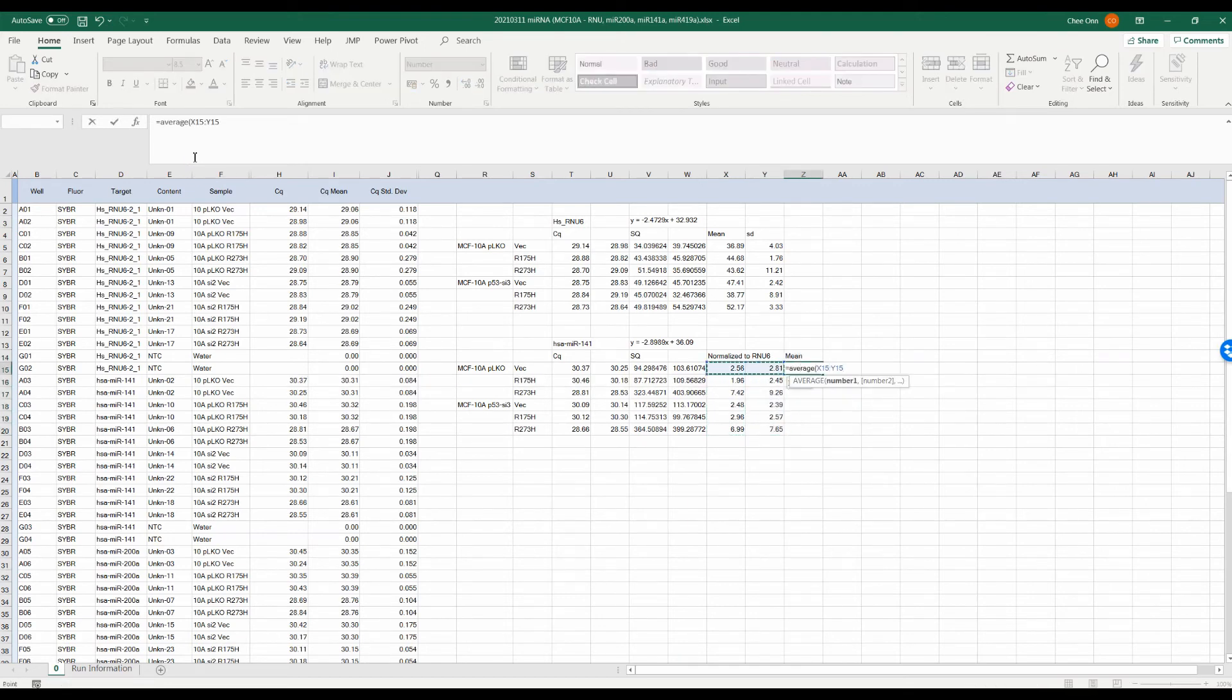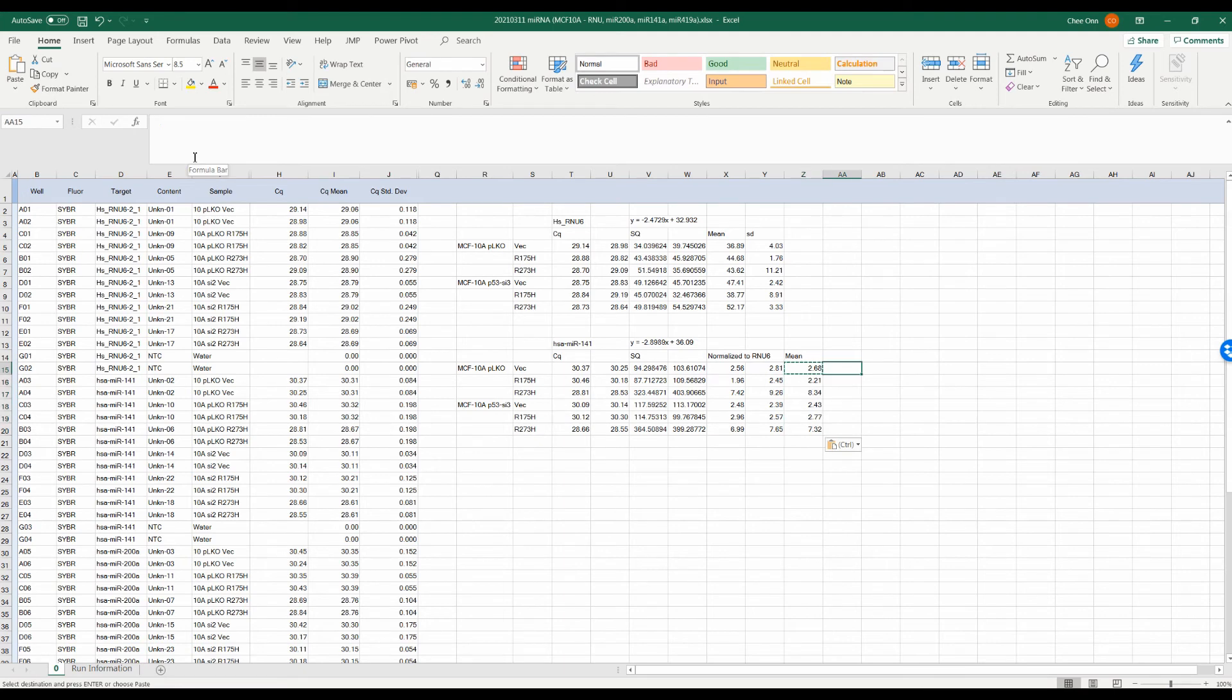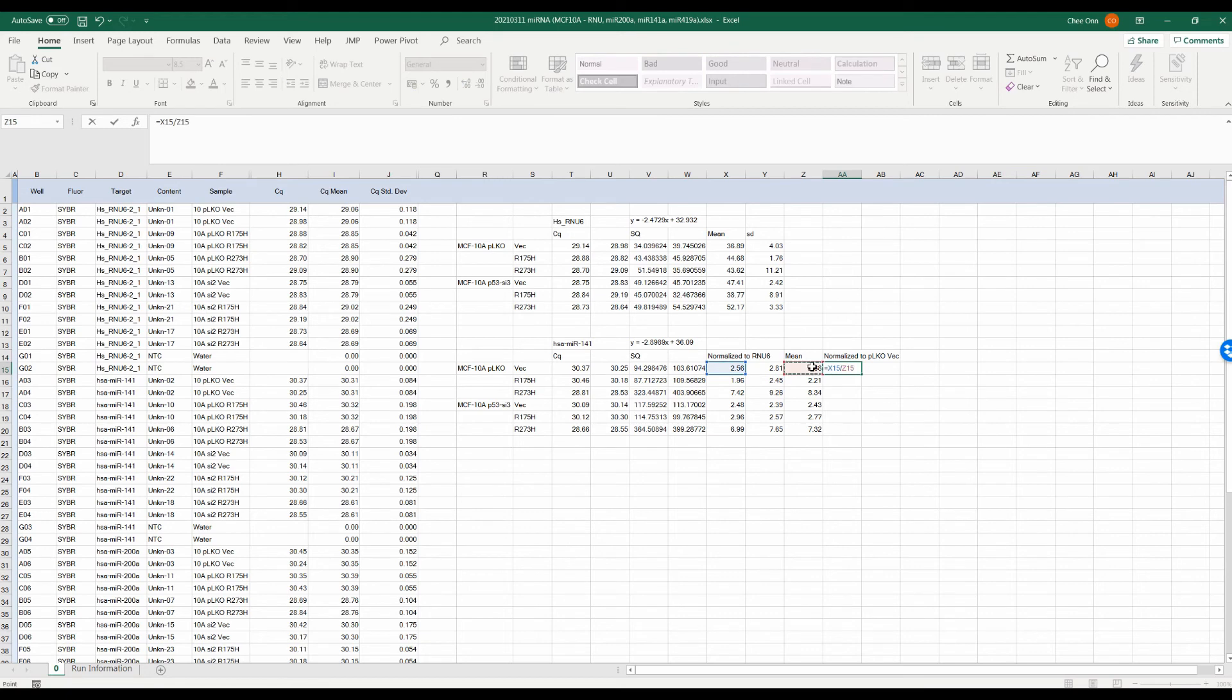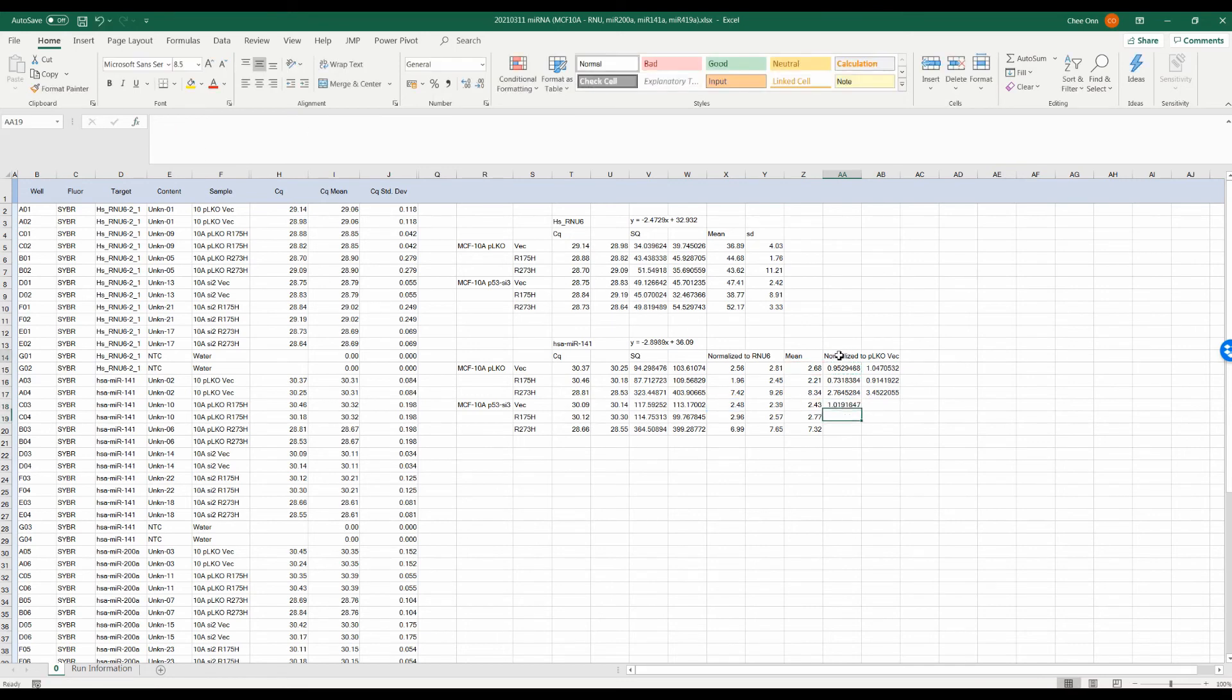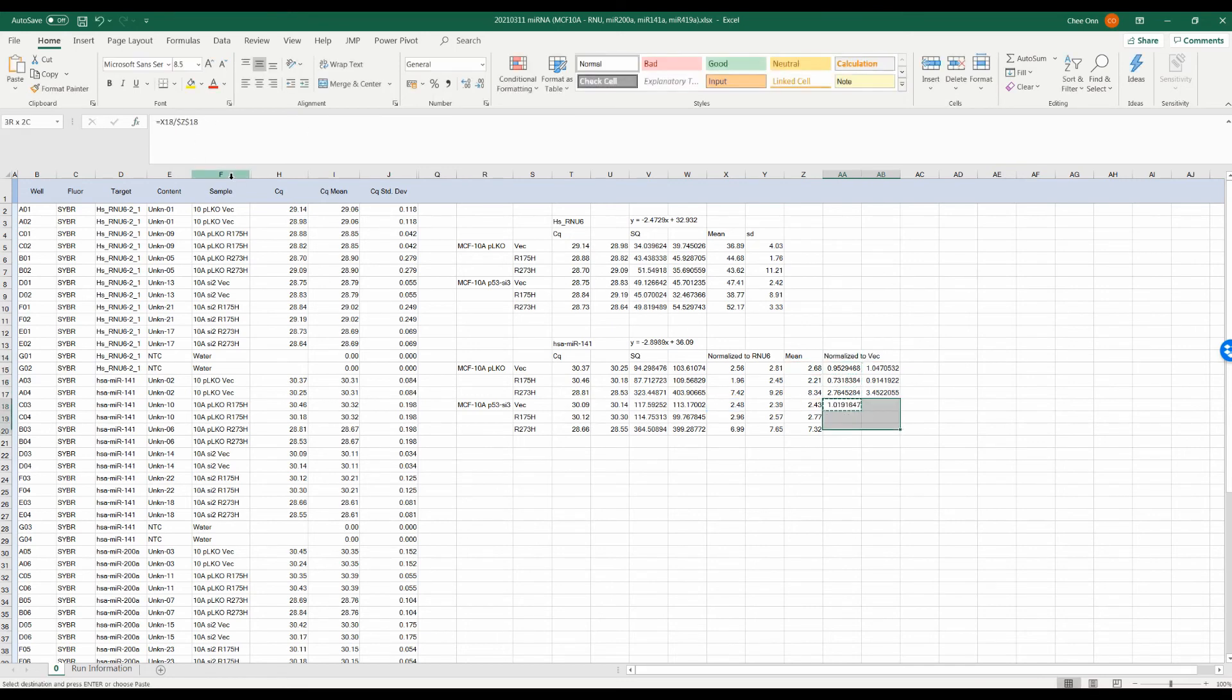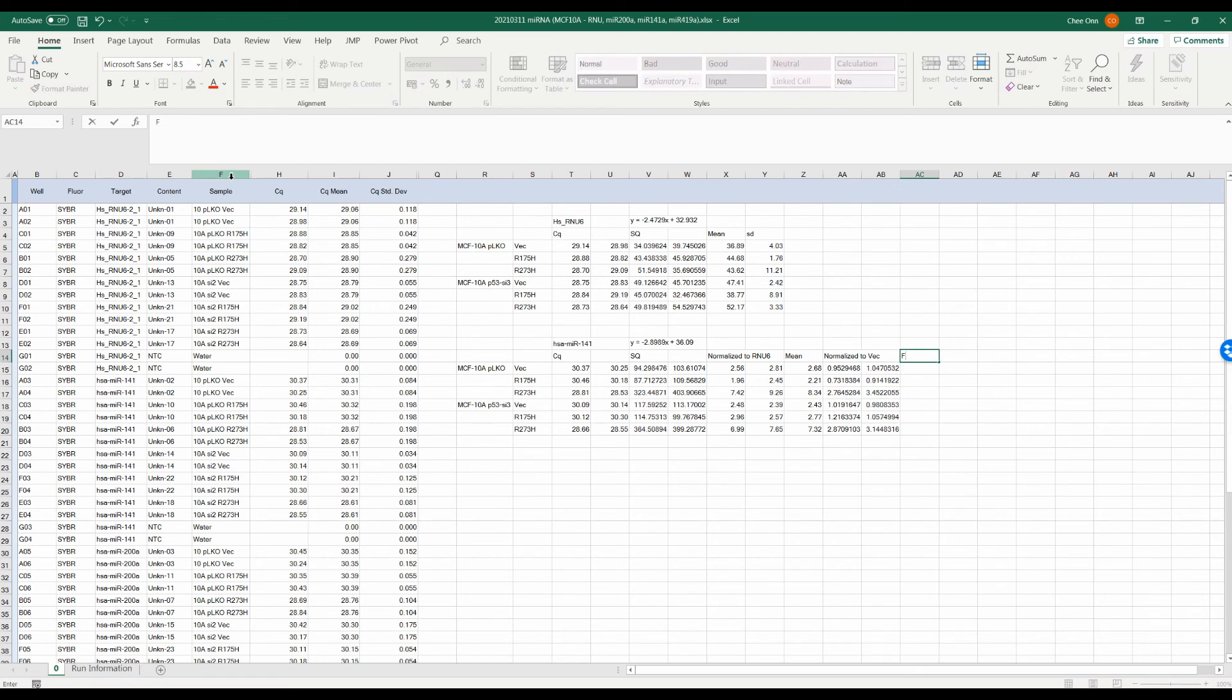After the SQ of our target genes are normalized against the housekeeping gene, we can start calculating the relative fold change caused by our treatment. Here, we will normalize the normalized SQ against the vector control cells so that the expression of the vector control cells will be arbitrarily set as 1. If our treatment increases the expression of the target gene, the fold change will be more than 1.